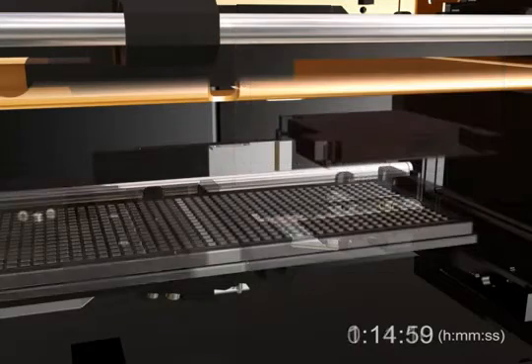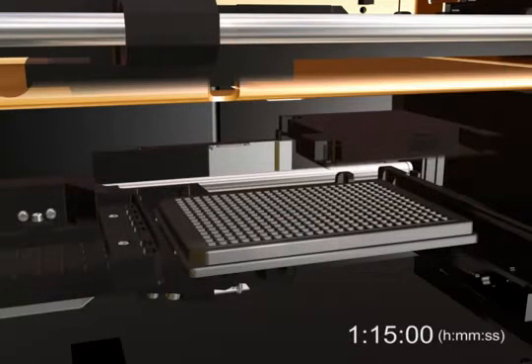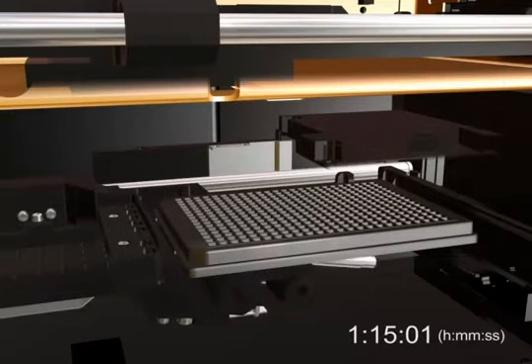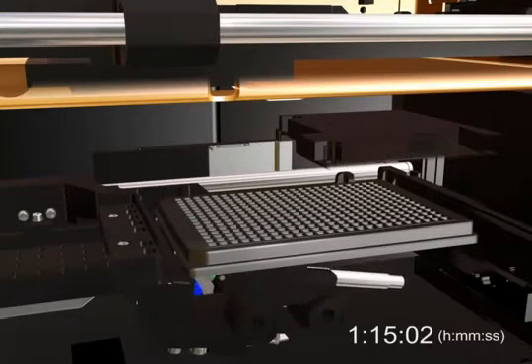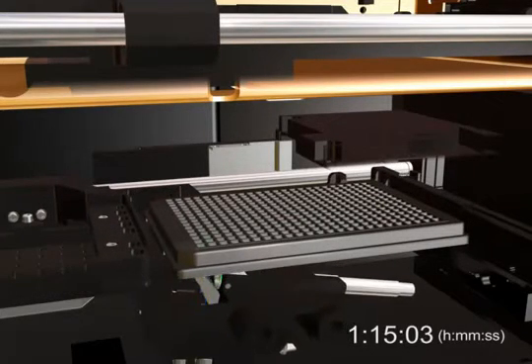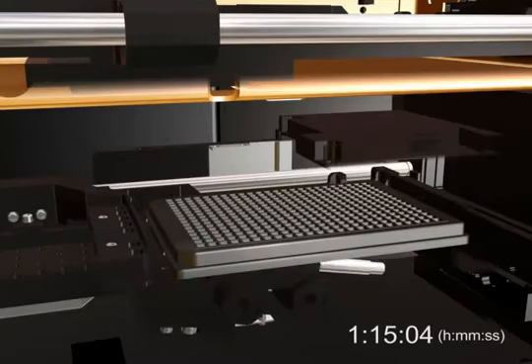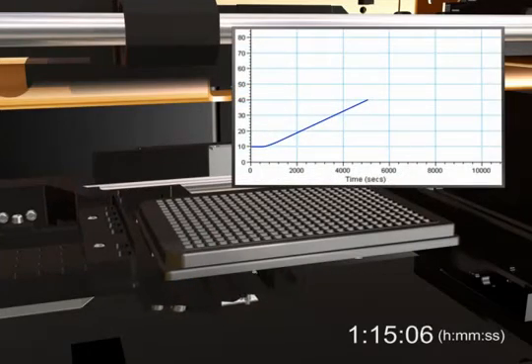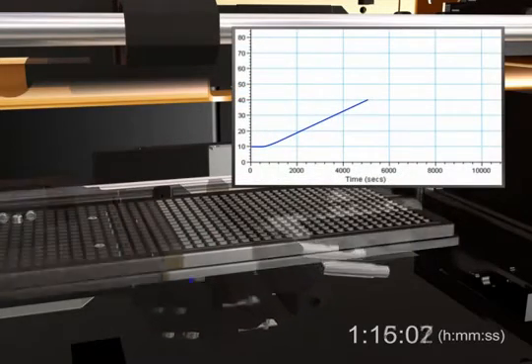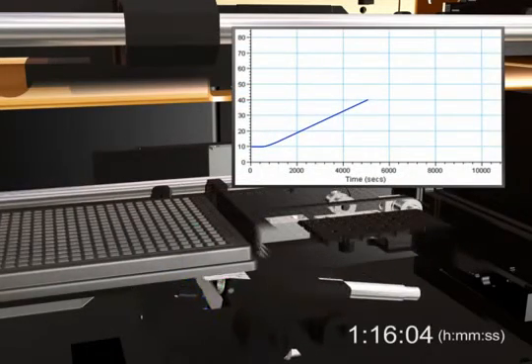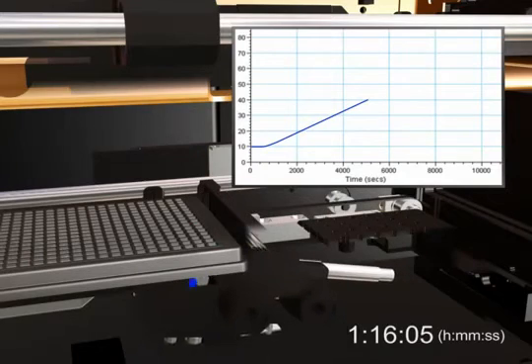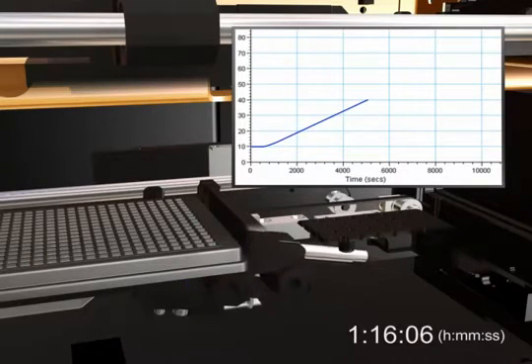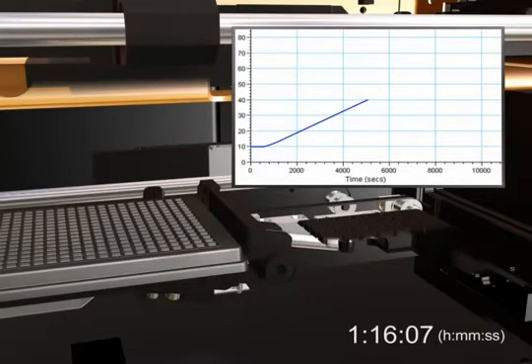The kinetic assay featured here uses fluorescence and is read from the bottom. But on the FlexStation system, kinetic reads can be performed using any detection mode. Plates can be read from the top or bottom, depending on your application.